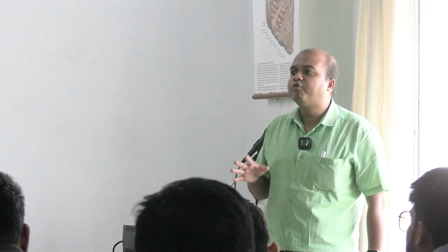In the case of neutrophils, particularly for beginners, it is not very easy to identify, although there are fine granules. So you try to identify neutrophils by the number of lobes. These can be two lobes also, like eosinophil, but in neutrophils you don't see that spectacle shape.